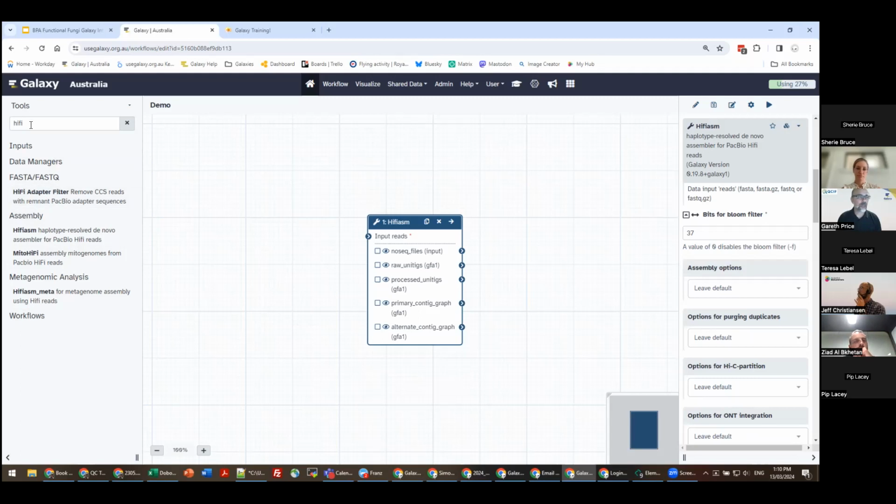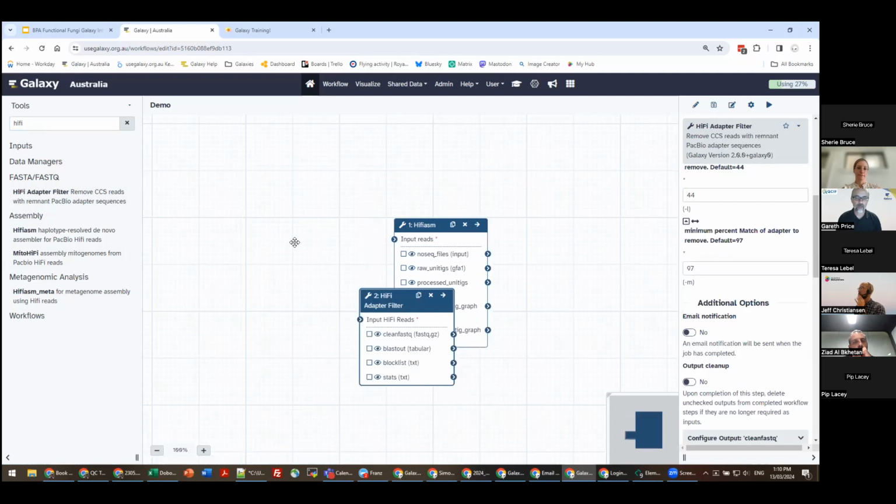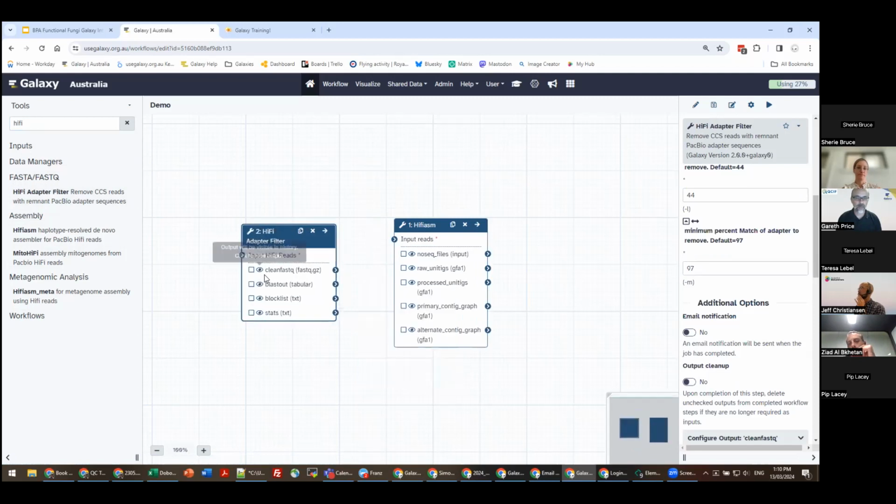What I've noticed as I ask for my tools, there's actually a QC tool that double checks that the input data is clean. So I'm going to bring this in as a separate tool, bring it to the left, and simply take the output of this tool and drag it to the input of this tool. This is a symbolic link that you're making visually on the screen. Under the hood, again, Galaxy is writing this as a data transformation, a folder structure, etc., a renaming exercise to move data from tool A to tool B.